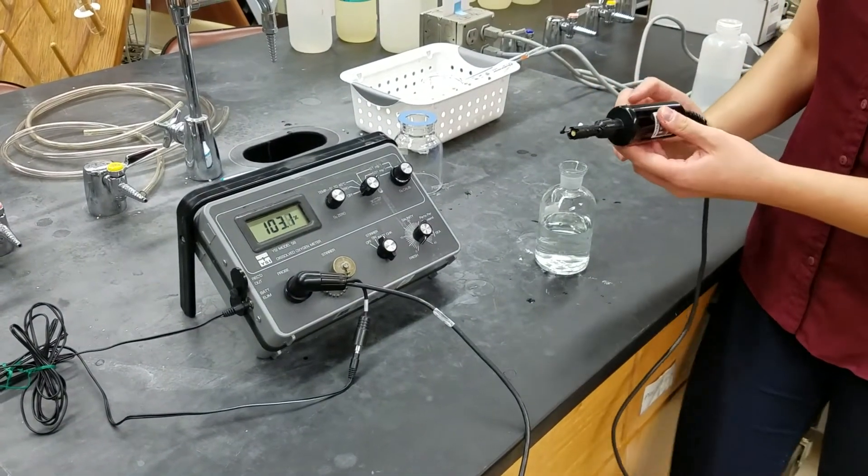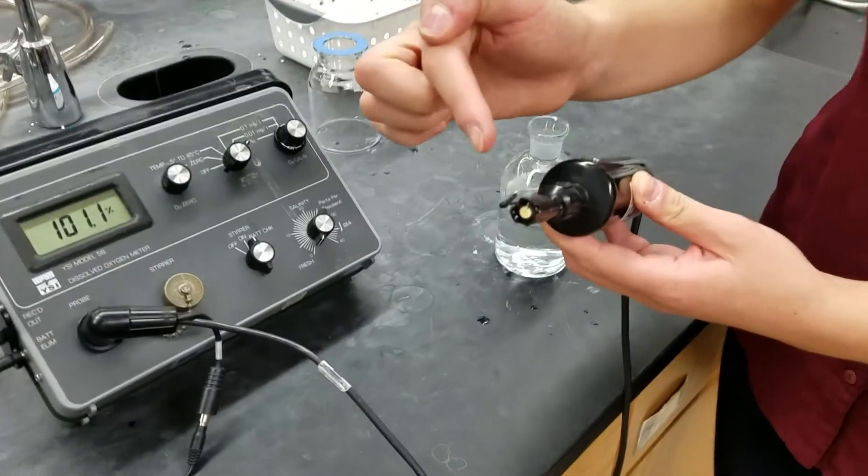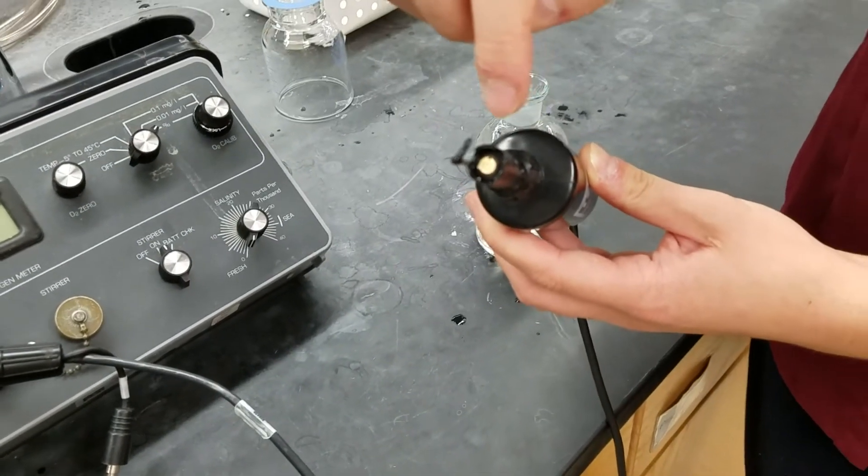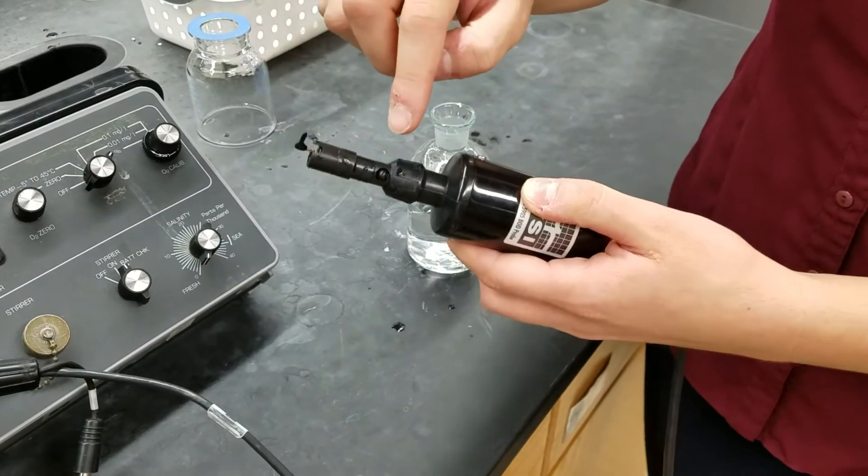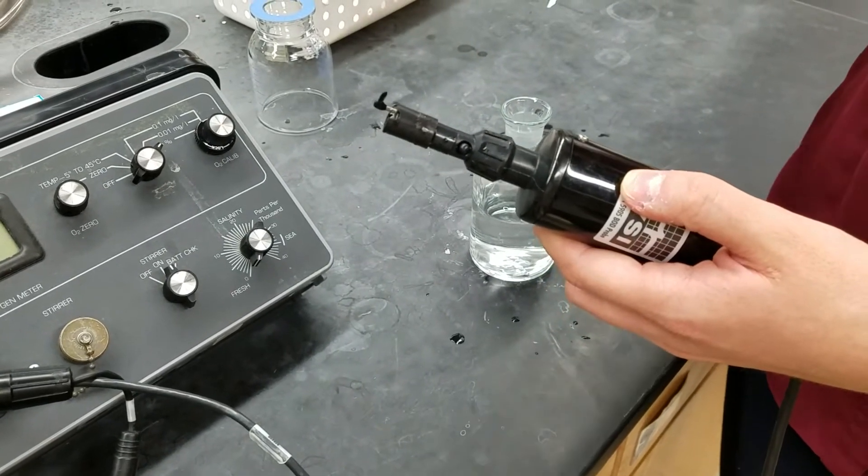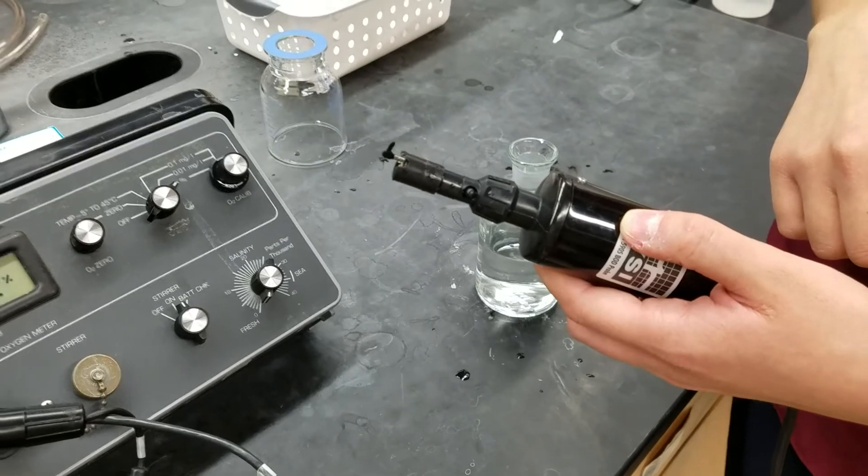And then if you look here, this little black paddle here, that is the stirrer, and then this is the oxygen probe here, and then this little bubble there, that's the temperature probe. So we can measure dissolved oxygen and temperature with the same instrument.